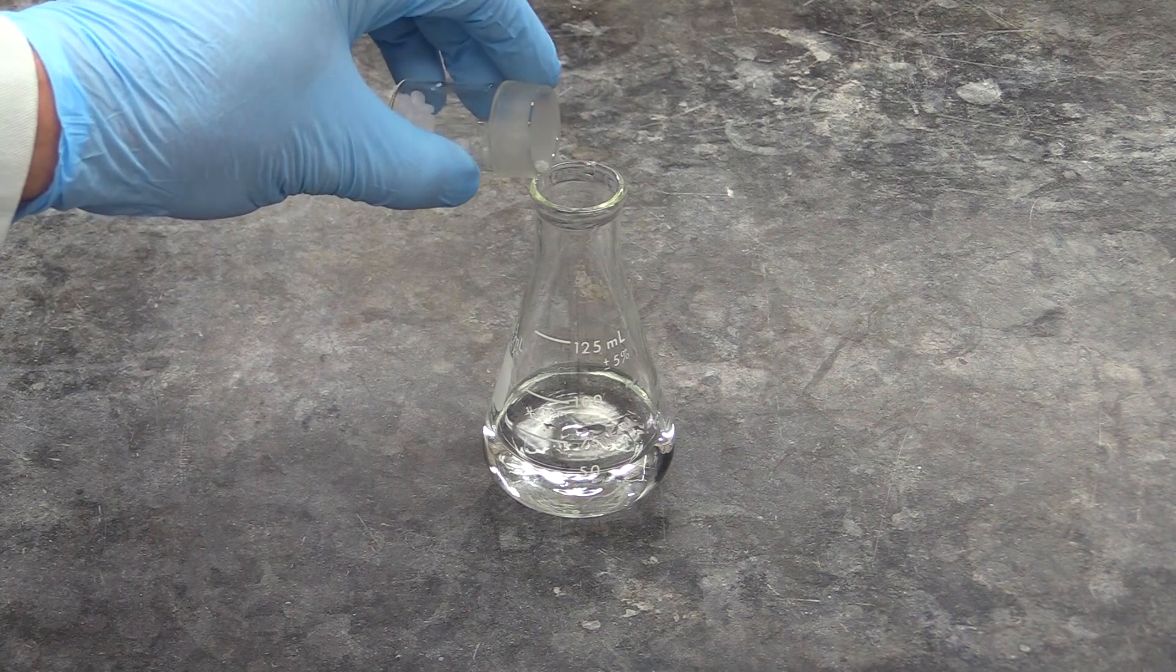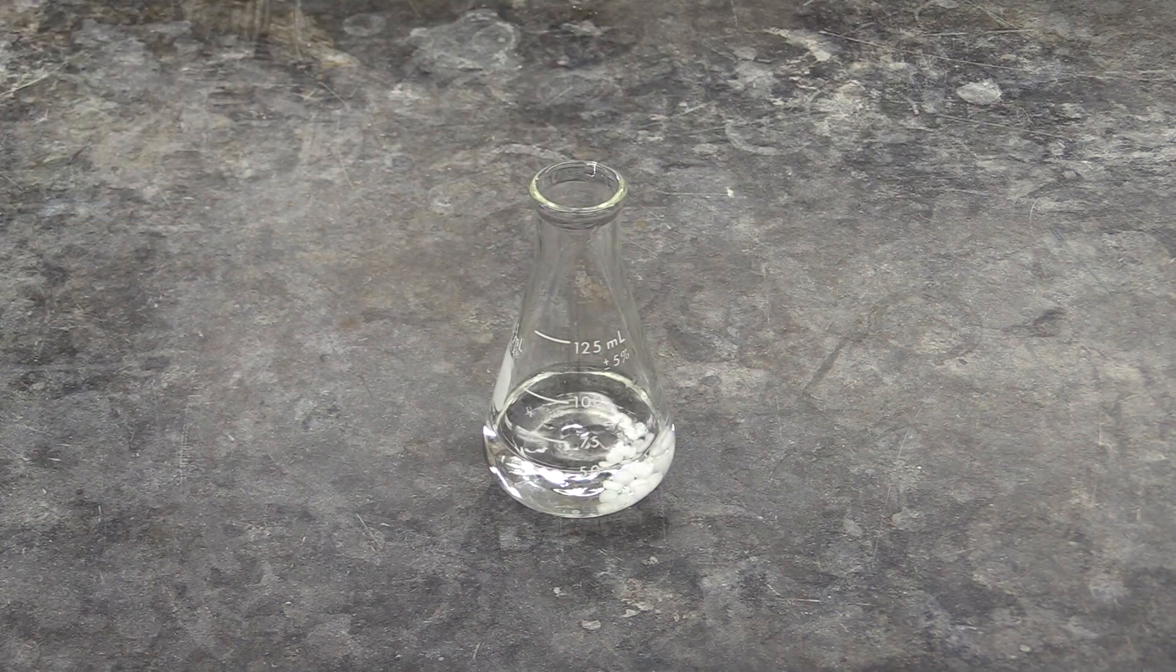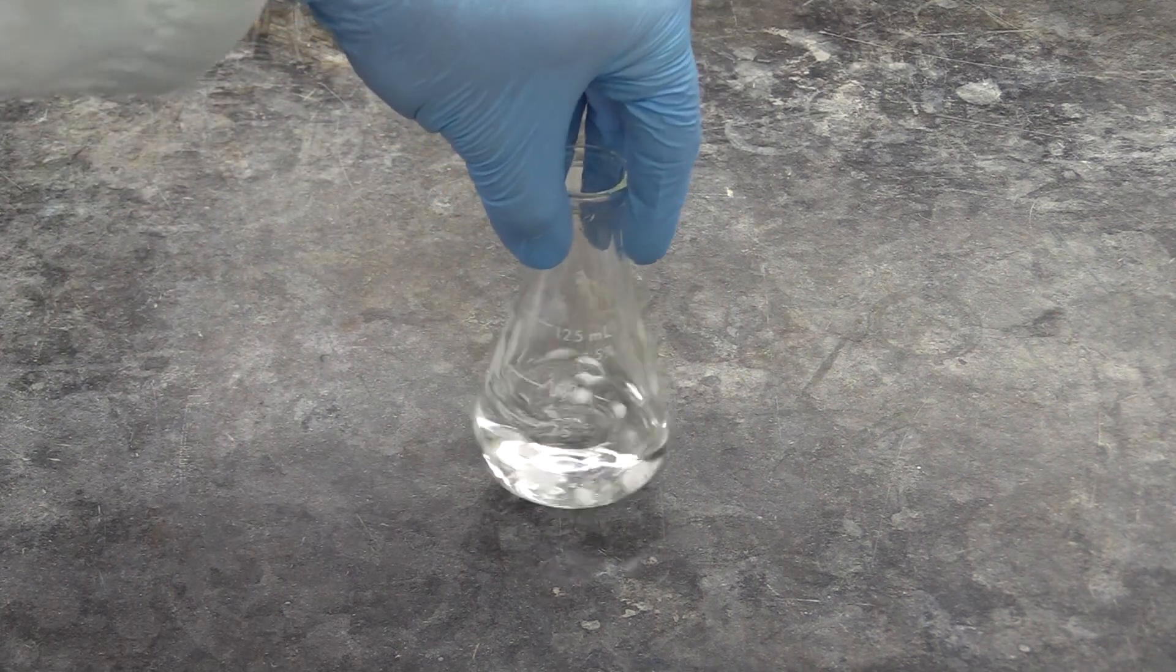And finally, you will add a few grams of sodium hydroxide to a flask of DI water. As for the previous flask, you'll monitor this one's temperature over the following several minutes.